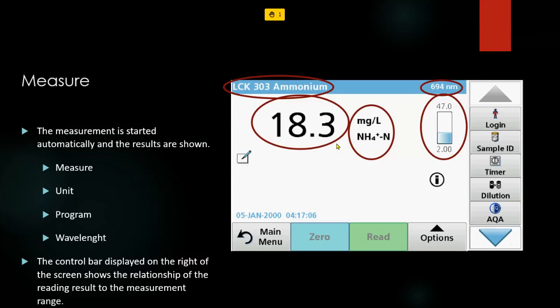If you filter the raw wastewater sample and we test for ammonium, nitrate, and total nitrogen, do they affect the concentration, the result?